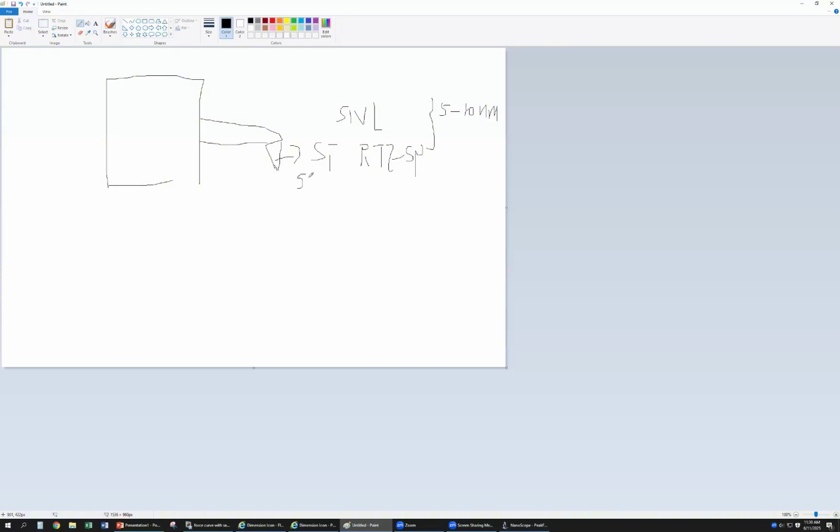Okay, so which one? The diameter, like the tip or this area? No, this one, this area. This area we didn't provide the value by email, but this length you also can get on the website. For different probes, this length is different. Most of the probes are 8 micron. Then 8 micron for most of the samples is enough.